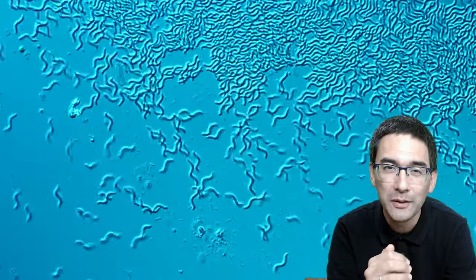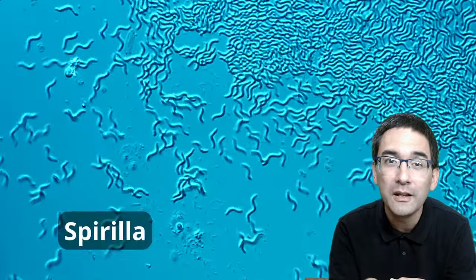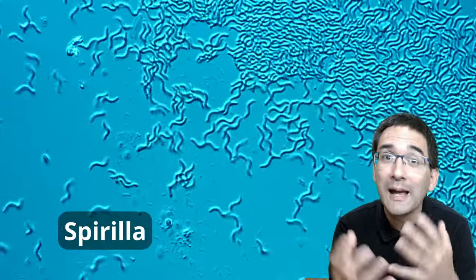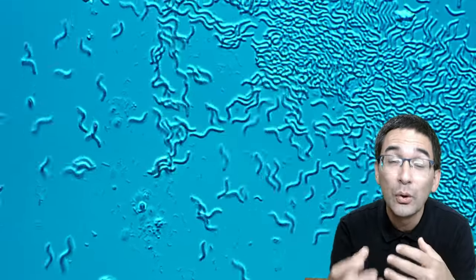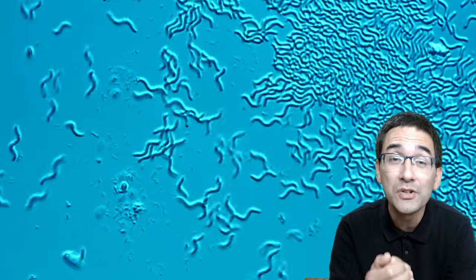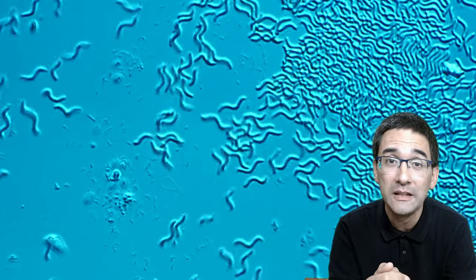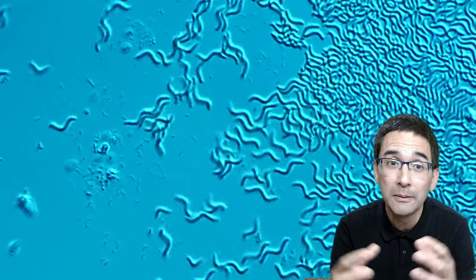Spirilla — the bacteria. Why are there so many of them? They're in there because they started to multiply as the sample started to age. Because I put the cap on, the whole thing went anaerobic and bacteria started to multiply. There were too few ciliates in there to eat up the bacteria, and for this reason they couldn't really be kept in check.